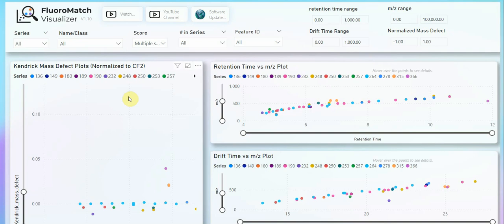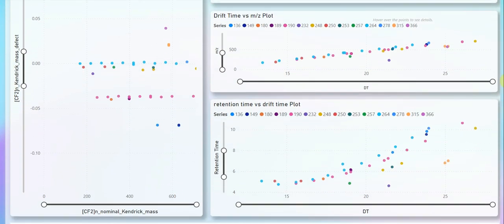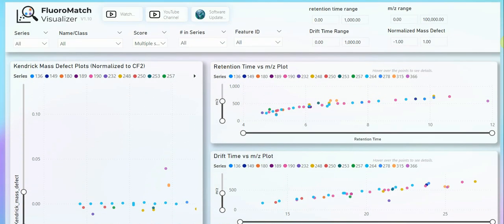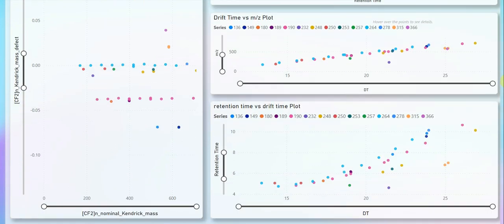And so the software that we used before this step annotates that feature list based on CCS and accurate mass values. And so now we can see those compounds that have confident hits. You can see a large number of them. And this makes it a lot easier.